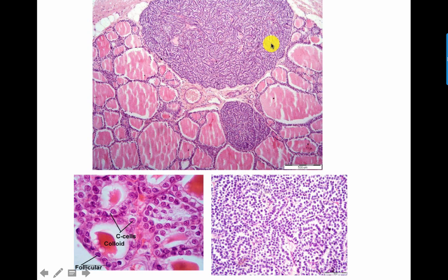And here we have the parathyroids. The cells are small, forming a huge collection of cells not in the form of follicles, and mainly they are basophilic. Here, by higher magnification, you can see clearly the evident cubical cells with central rounded nuclei.